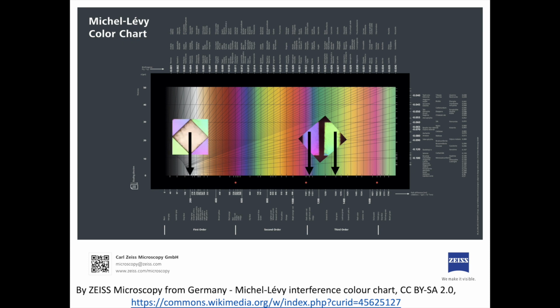In the case of these particular plates, where our interference colors yielded path differences of 1330 nanometers and 1130 nanometers, the difference between these two path differences will be 200 nanometers, corresponding with a light gray interference color. And that's exactly what we see with this experiment.